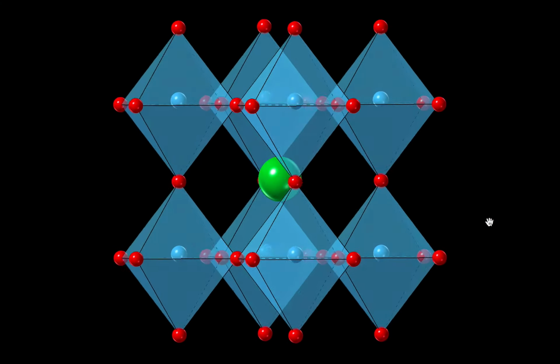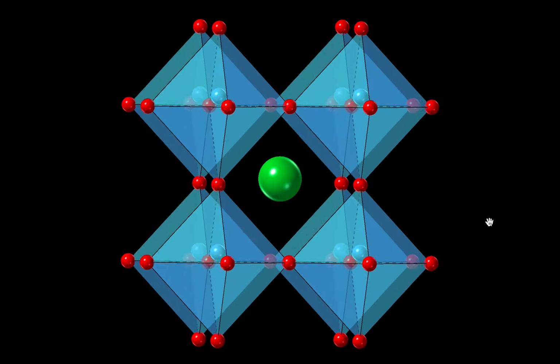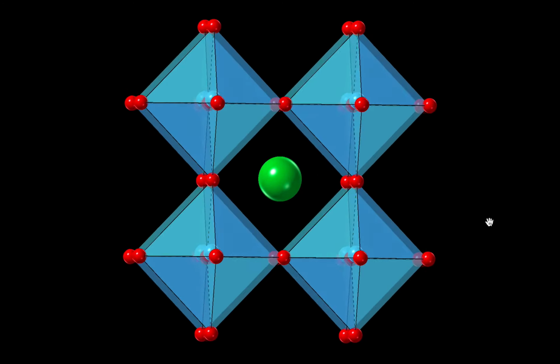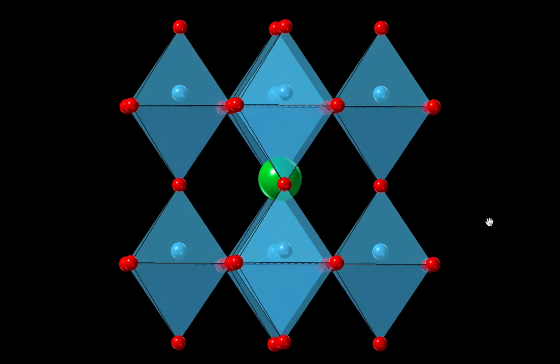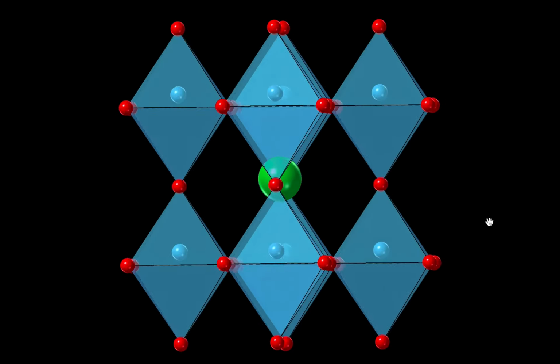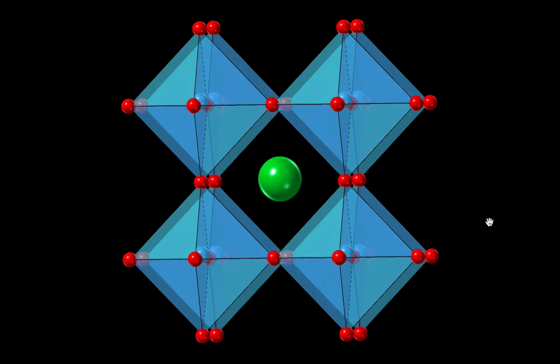Welcome to CrystalMaker 10. In this tutorial we're going to take a look at our new live powder diffraction mode, which is a great way of understanding how structural behaviour, such as this phase transition in barium titanate perovskite, affects the powder diffraction pattern.